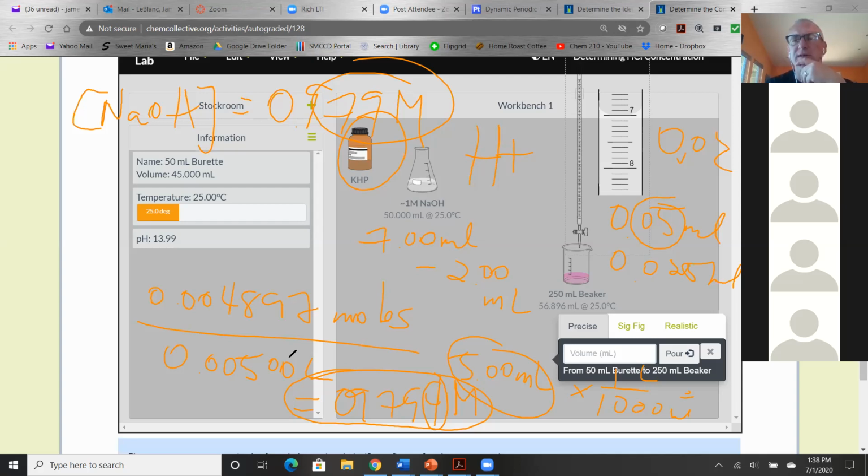No, it should be less than 1. Okay. Yeah, if you get a concentration greater than 1, you've probably done something wrong. Your answer should be somewhere between like 1 and like 0.95, probably somewhere in there. So do it 3 times, and your answer should not be that much different. I think if they're off by more than 5%, just do another one and drop the weird one, and then just report the average. What about the weights of the beaker if we didn't take it in the beginning?